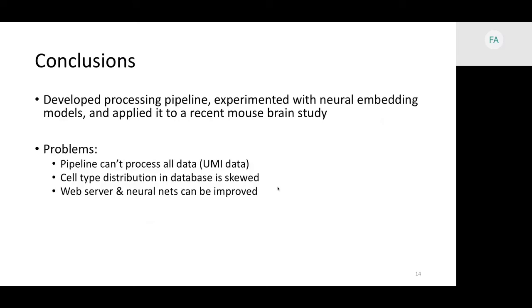Specifically, a big one is handling UMI data. There doesn't seem to be a good standardized way where people are publishing this that we could pull the correct barcodes, and even within one technology company, they might update it. So coming up with a good way of wrangling this data in an automated fashion would give us access to an even larger database, and that's very important.